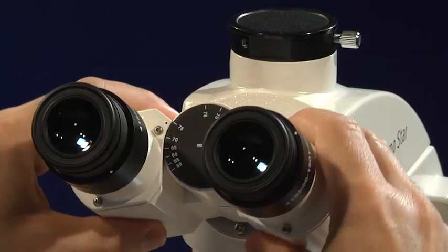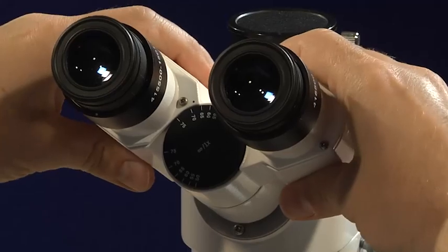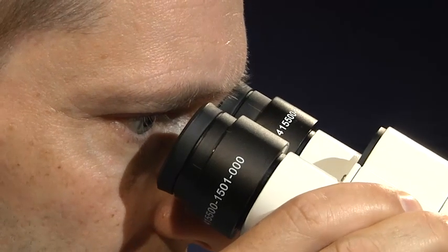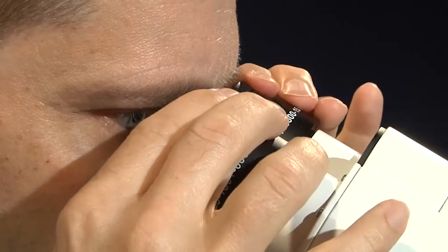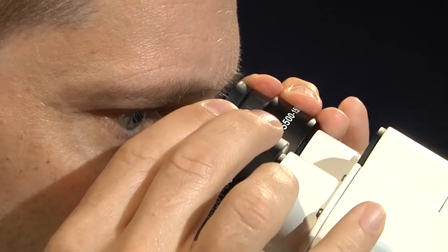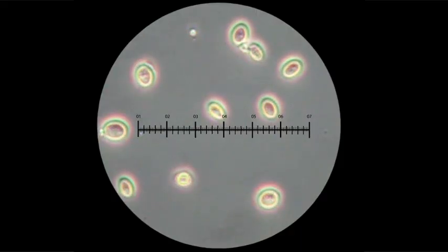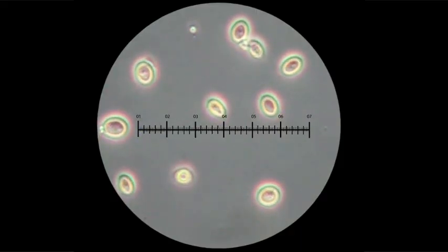The eyepieces further magnify the primary image produced by the objective, normally by ten times. They do not, however, increase resolution. Eyepieces may also contain additional devices like measuring graticules, allowing us to measure object dimensions, or reticules for easy counting of small objects.